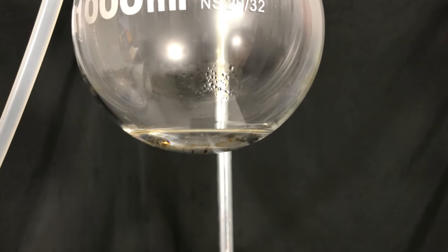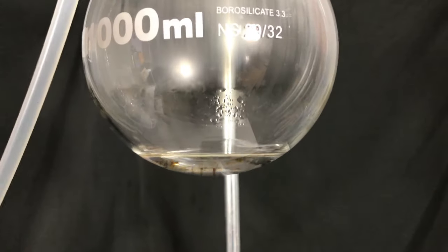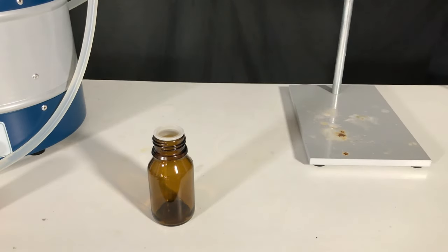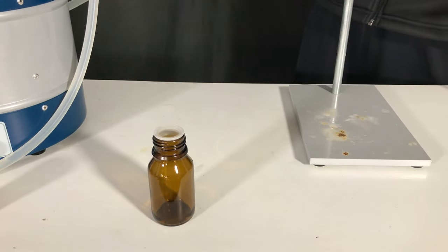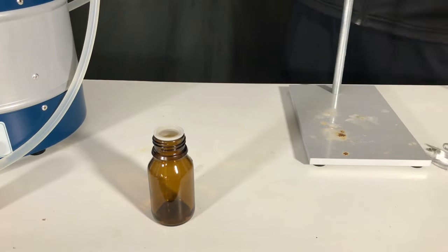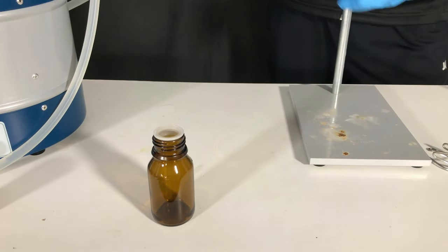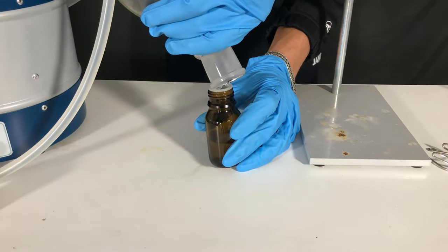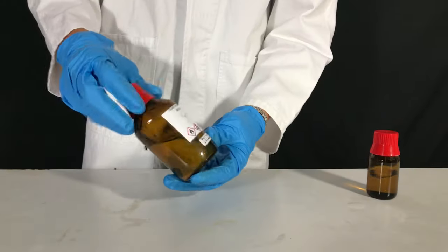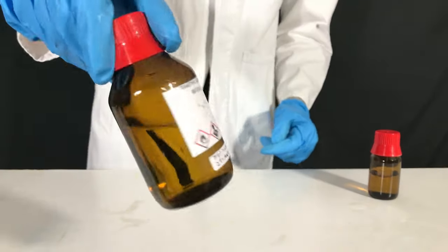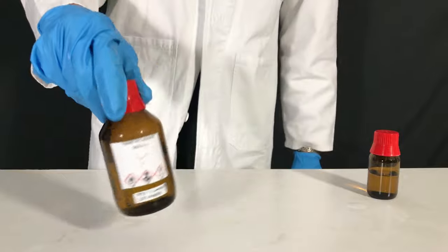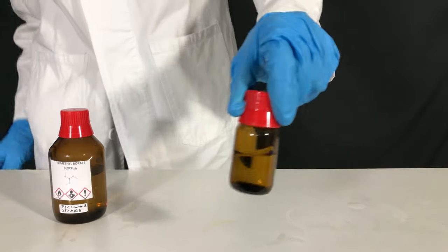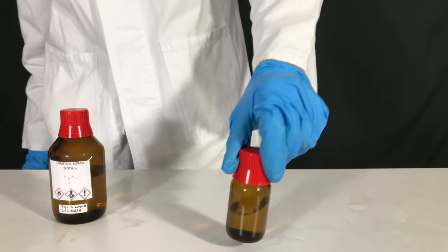From the second distillation we collected 30 ml of methanol containing just a little tri-methyl borate. This was transferred to a separate storage bottle. And this is what we collected: some tri-methyl borate methanol azeotrope and some mostly methanol containing still little tri-methyl borate.